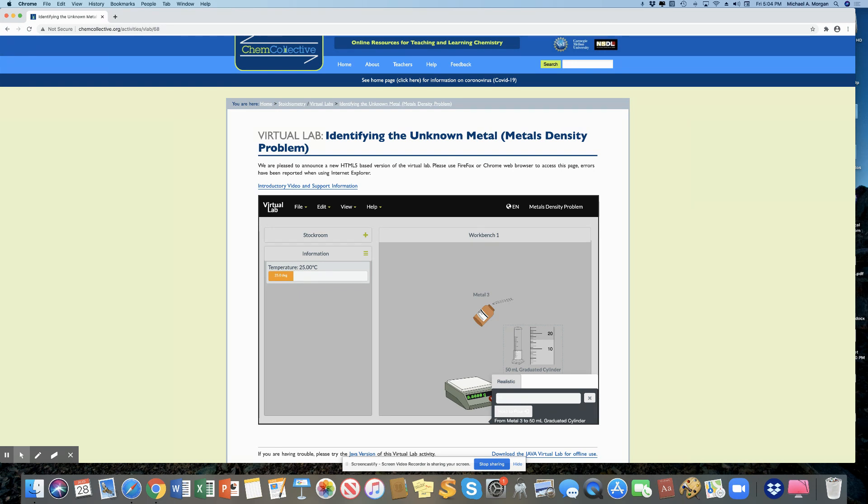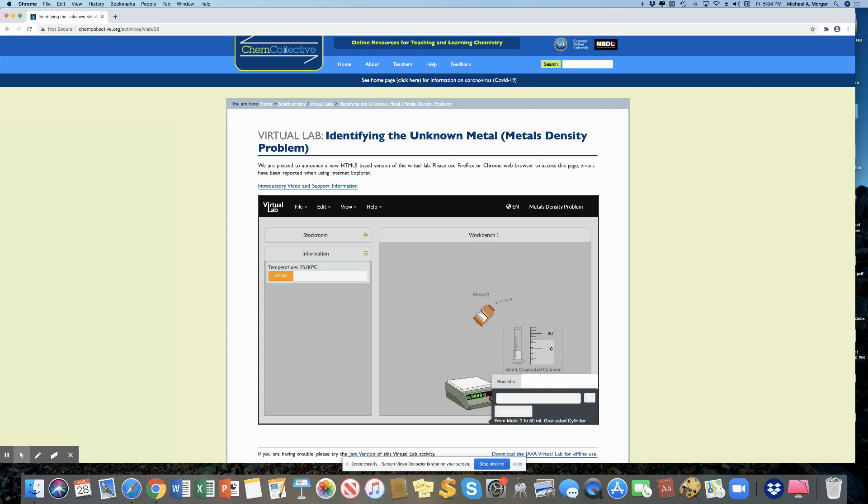You know, maybe it's a 15.9, but I'm looking at it really close. And I think that's 16.0 milliliters. So I'm going to write down 16.0 milliliters is my volume. I'm recording that right now.